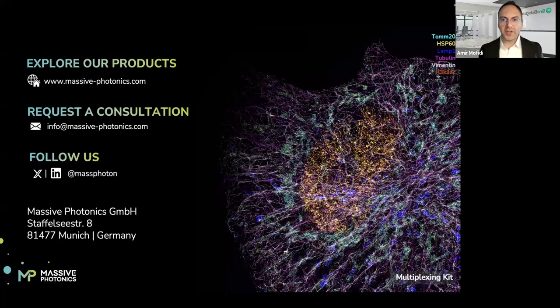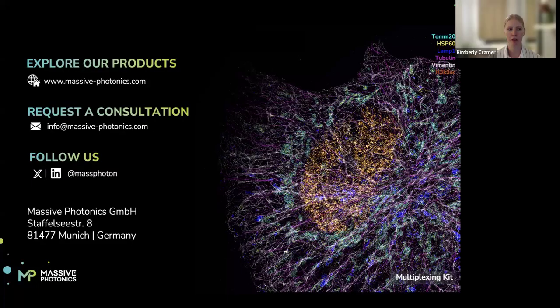Thank you. And Muriel asked, what are the practical challenges or limitations when imaging a larger number of cellular targets in a single sample, for example, 10 plus? So I would say the main challenge when imaging large numbers of targets is really screening and finding really well-working antibodies or nanobodies for your targets. Now that we have this pre-incubation, you can use primaries of the same species within the same sample. That helps a lot.